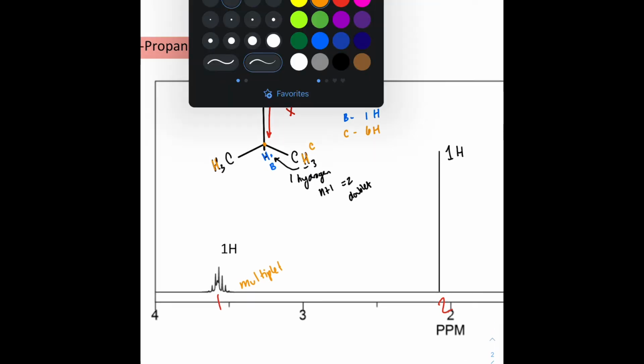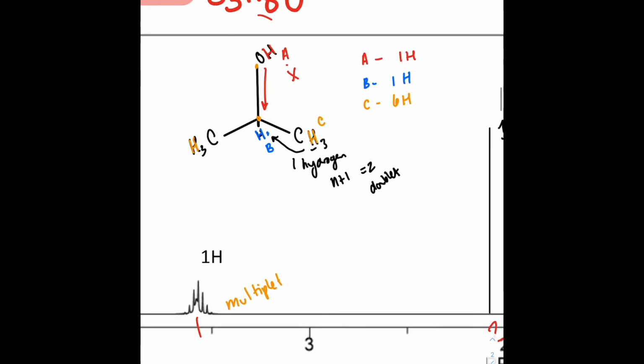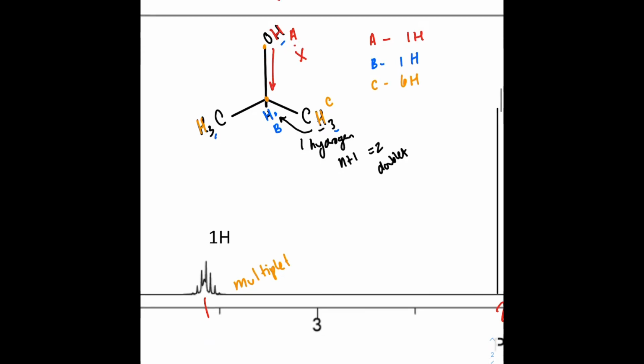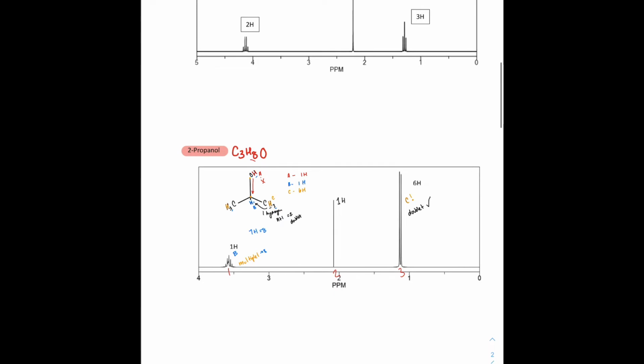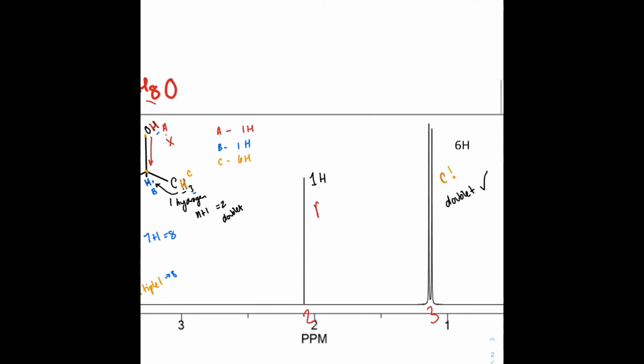So process of elimination, we're going to look at our hydrogen, no, just kidding, it was blue, our hydrogen B to figure out how many neighbors he has, and so he has 3 on this side, 3 on this side, and then this hydrogen, so that's 7 plus 1, which is 8, and I know that that's kind of hard to see, but that is going to end up being our 8, so we can pretty confidently say that this is our B. And then that would be process of elimination. This would make this our A group.